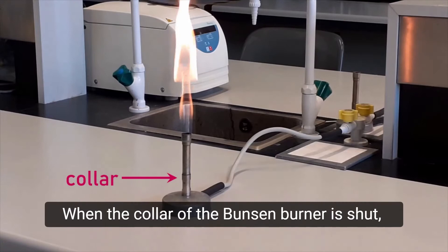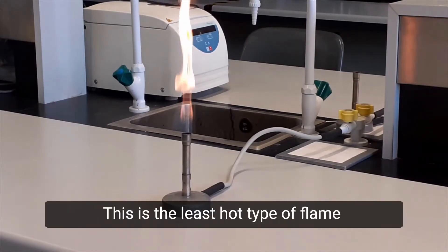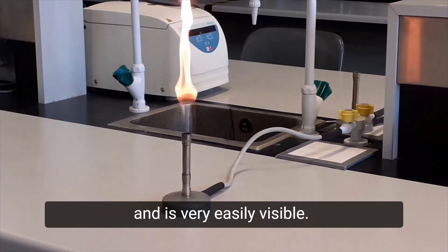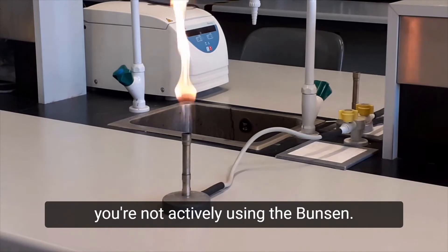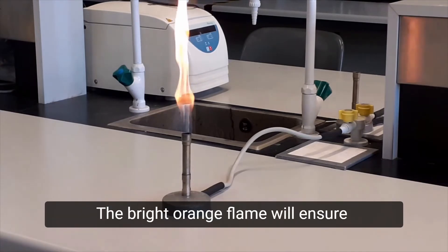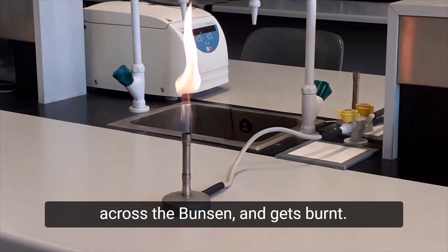When the collar of the Bunsen burner is shut, the flame is orange. This is the least hot type of flame and is very easily visible. Keep the flame like this when you are not actively using the Bunsen. The bright orange flame will ensure that nobody accidentally stretches their arm across the Bunsen and gets burnt.